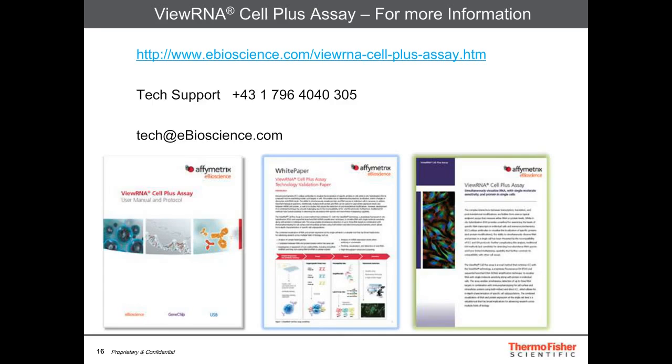The next is, what do you feel is the best normalization control for relative mRNA level assessment? Typically, we use a housekeeping gene. We use beta-actin, GAPDH. Sometimes the levels of beta-actin can actually differ in cells, especially during the course of an experiment. We can see levels that actually fluctuate. So a lot of times we'll just pick a relevant housekeeping gene and use that. We have a list of housekeeping genes that have been validated for different cell lines, which is available on our website.